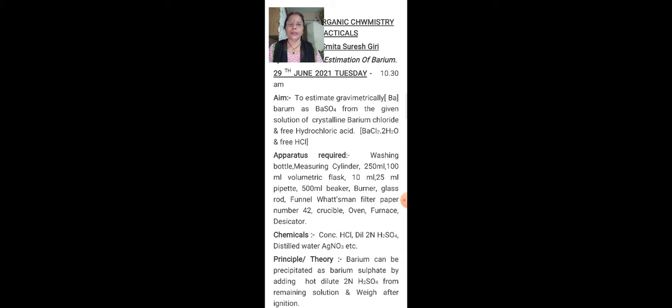See, in the aim, I made a spelling mistake, just excuse me. Please correct it: to estimate barium gravimetrically. So barium, spelled B-A-R-I-U-M. Okay, just correct it please.